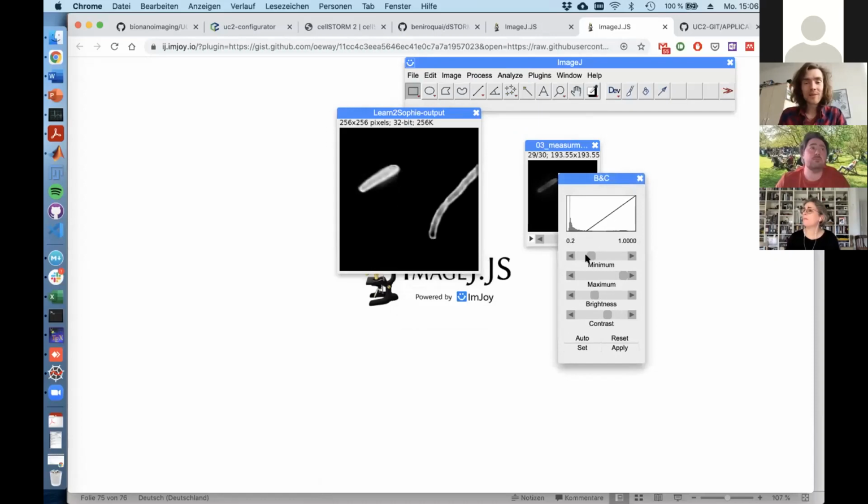But what I showed you in the slides, that's real time. So you get a snippet of your frame with 256 times 256 pixels updated every second. So you have roughly 1 FPS, like 1 frame per second, with a CellStorm result.